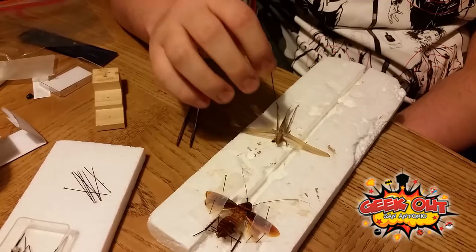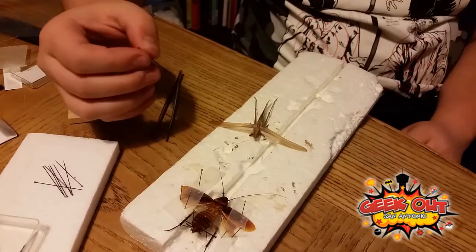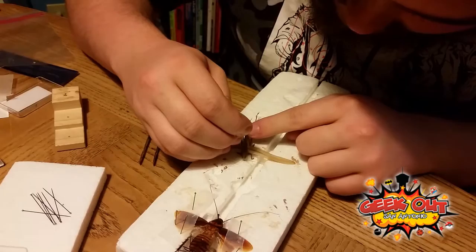He just died so he's pretty droopy right now. For orthopterans, it's your choice — you can put them on one side or the other, or you can put it directly in the middle. What is your general preference? I like to put it in the middle; I think it makes it look better. On one side it kind of looks lopsided and weird, so I like putting it right in the middle.